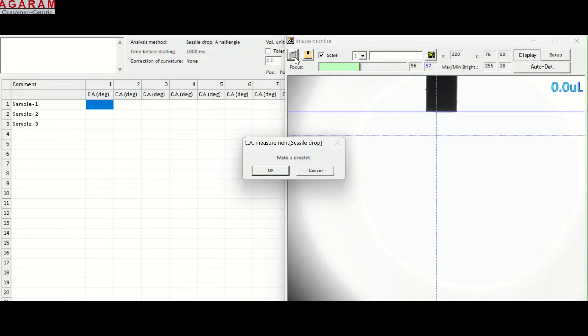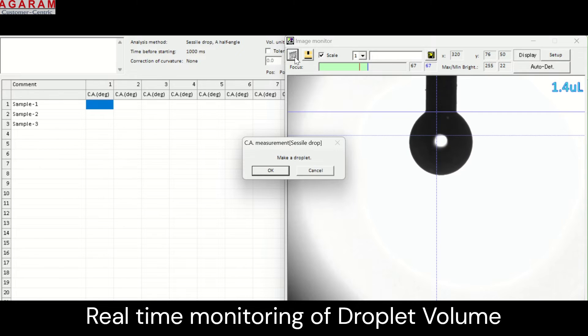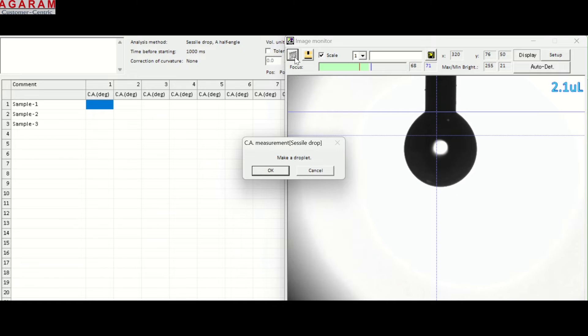The measurement process can be monitored in our FAMAS software. Real-time droplet volume is displayed on the screen, allowing for controlled and fine adjustments.